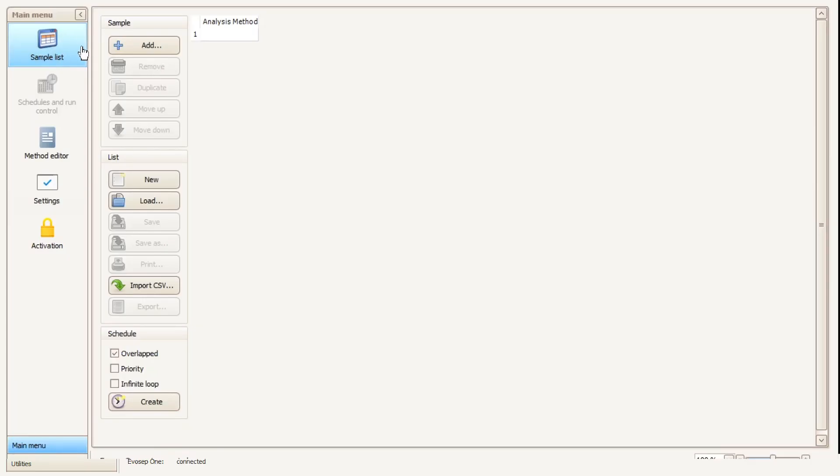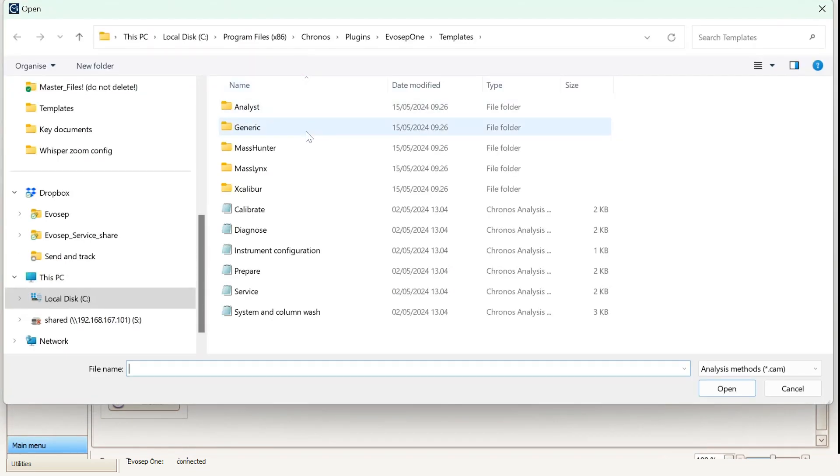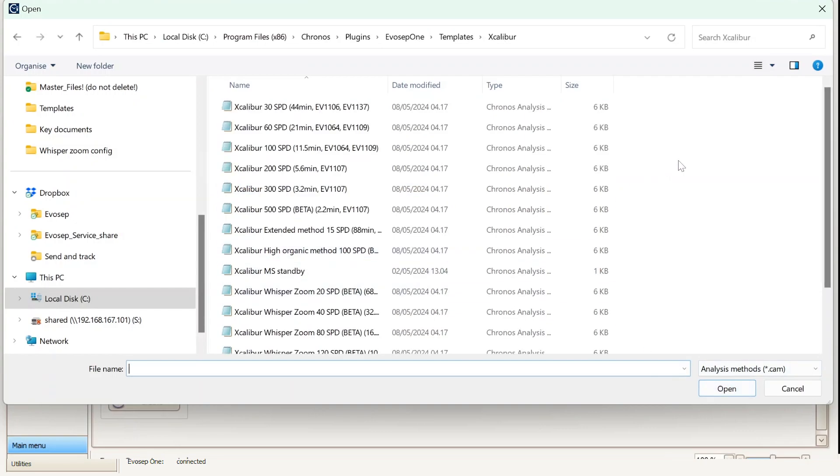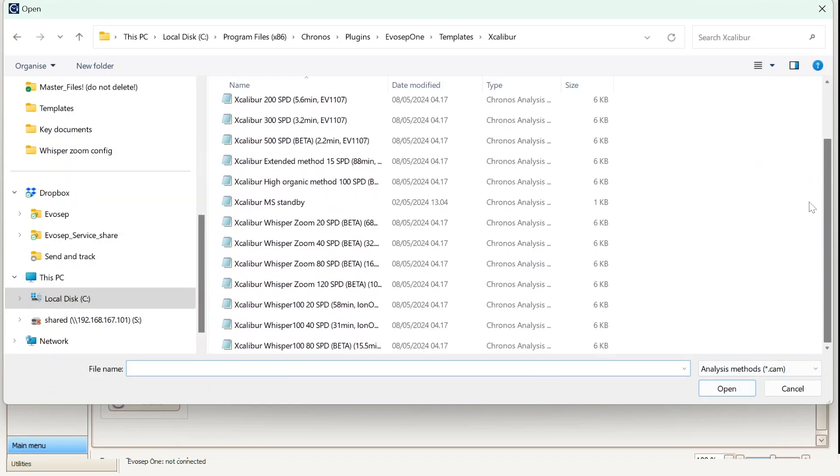I'll just quickly show you where to navigate to find the new WhisperZoom methods. Once again we jump back into Chronos, head back to the sample list, select the three dots representing our method selector, navigate to the relevant folder, and here you'll find your WhisperZoom methods listed at the bottom.